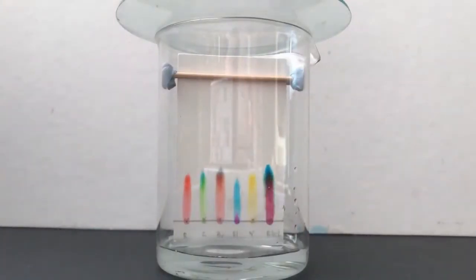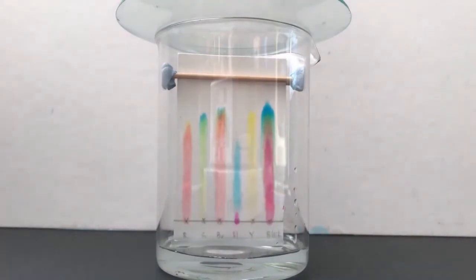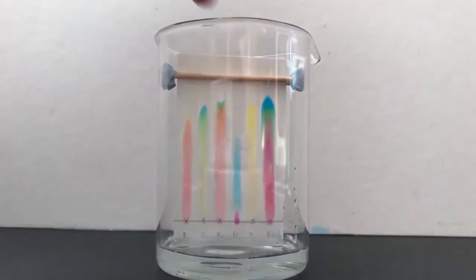We can see as the solvent moves up the chromatography paper, it carries the different dyes along with it. Dyes which are more soluble in the solvent will migrate faster and further along the chromatography paper. When the solvent front reaches near the top, we will then remove the chromatogram. We will then mark the solvent front with a pencil line.